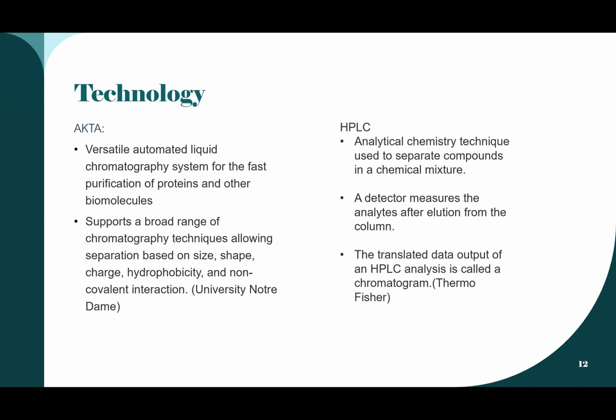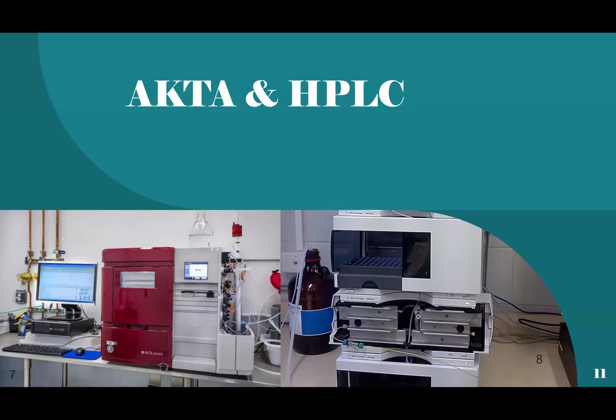And so the HPLC system, the one that was on the previous slide, is also an analytical chemistry technique used to separate compounds in a chemical mixture, but this one has a detector inside of it. You can't see it on here. It's condensed, but it's like stacked little boxes on top of each other. In the middle, you can see these little lines where your liquid will flow through, and they change those lines and the sizes of them to conduct size exclusion.